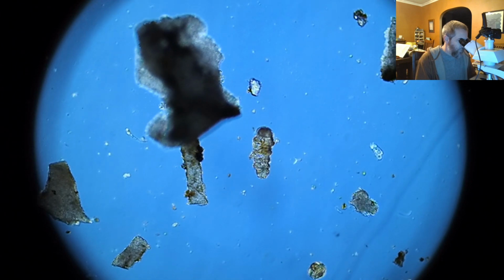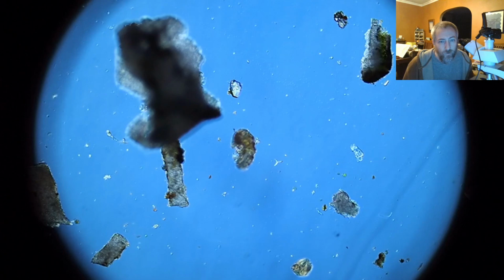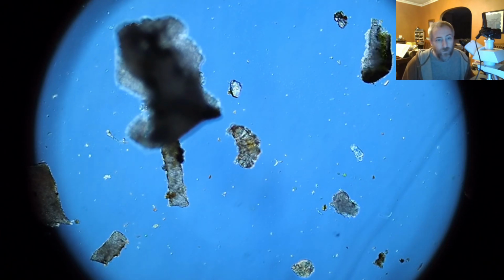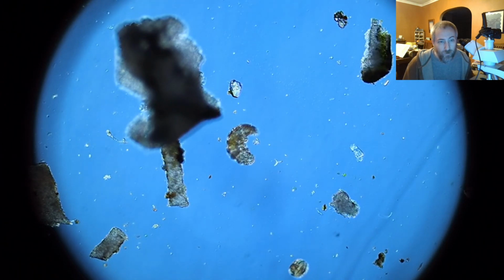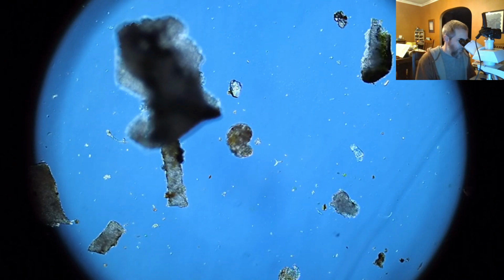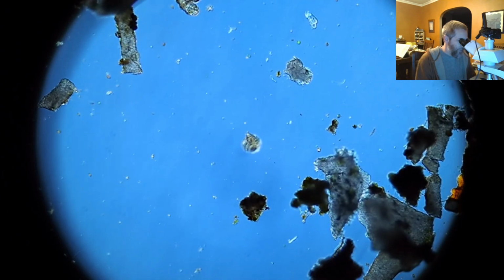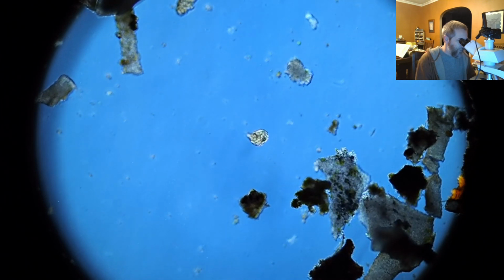I made some more samples with water bears in them. In this case, just some sticks that I collected from a local wetland, sort of a forested area around the wetland. And found some water bears and rotifers, the sort of normal things that we've been finding in the lichen. They're just really starting to wake up right now, so this little rotifer is not quite hydrated yet.